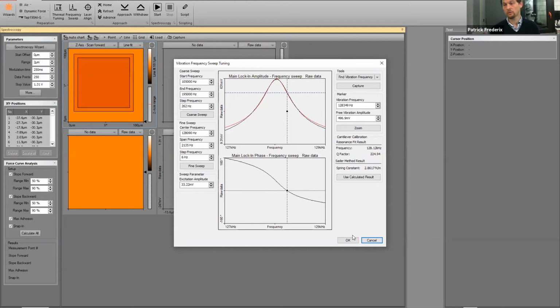Because we work with an aspiration force there, you can really go up to more than a micronewton of force, which is hard to reach with chemical binding of a cell to a cantilever. But the general approach is the same, whether it's in liquid or in air.